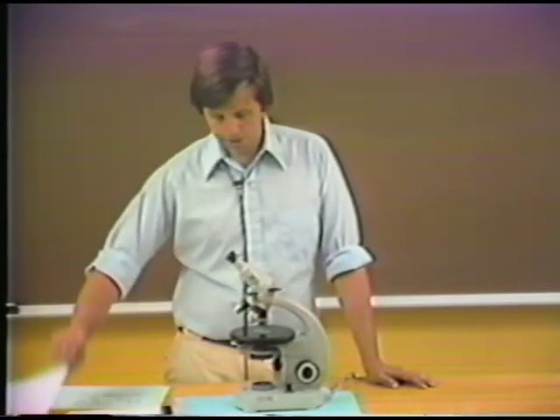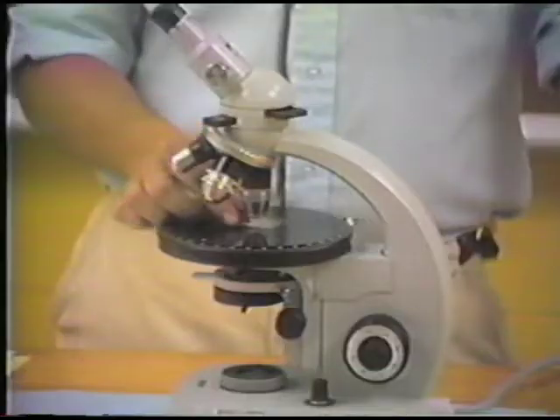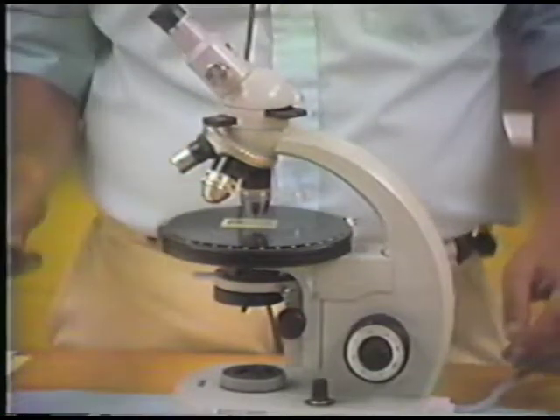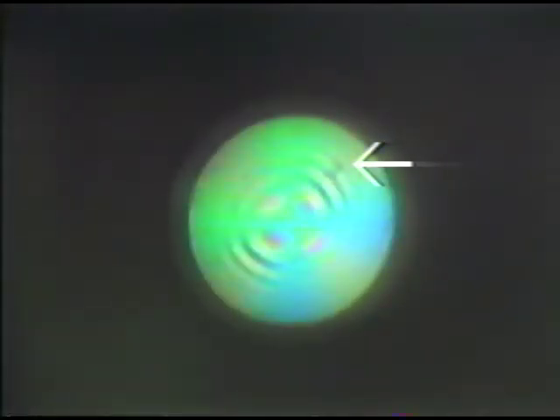Now, I'm going to switch to the mineral calcite to show, again, a centered optic axis figure, and to demonstrate the determination of the sign when we have many color curves. In this particular case, instead of using the gypsum plate, we use the quartz wedge. And we insert the quartz wedge and watch the movement of color curves, again in this northeast quadrant. Because calcite has such a high birefringence, the quartz wedge is much easier to use, so we now insert the quartz wedge and we watch the movement of the color curves.